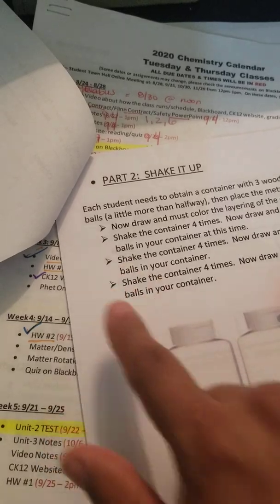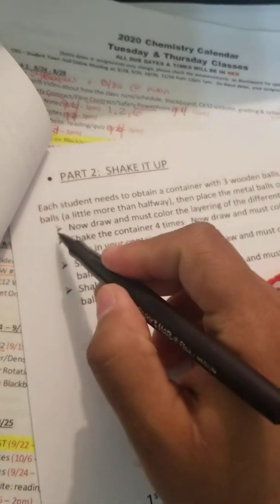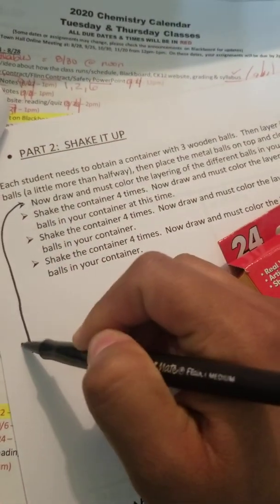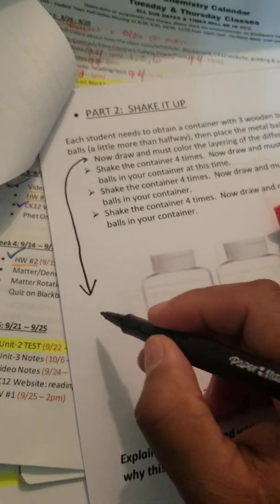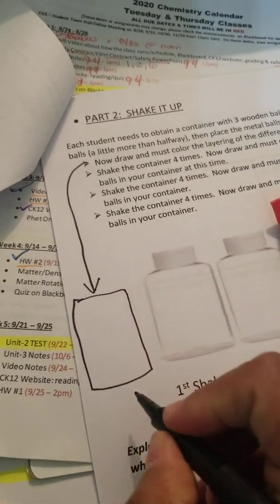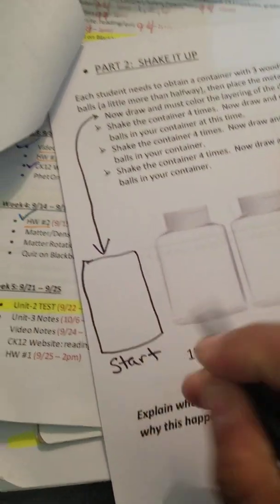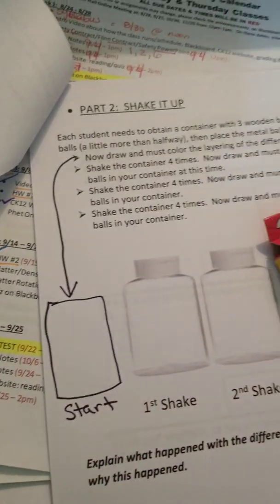Go ahead and do that drawing, and I'm expecting you all to watch this video so you can do your lab. Let's do a little container. Draw in your container, and write starting or start, because this is going to be our original starting.